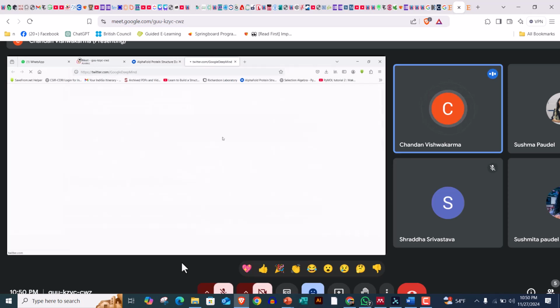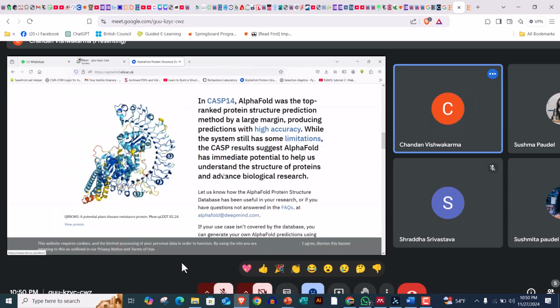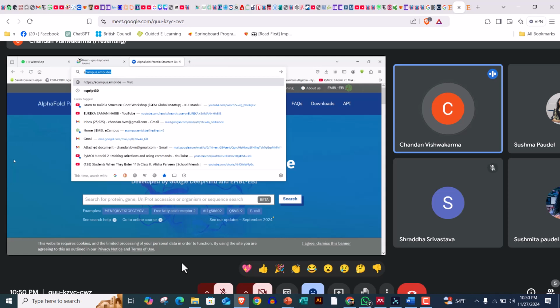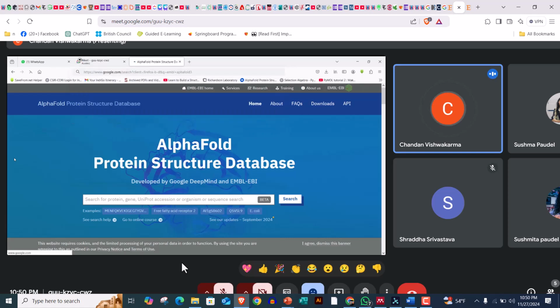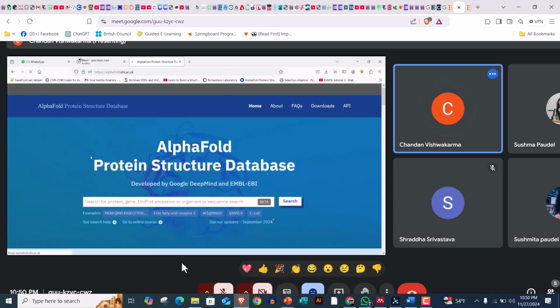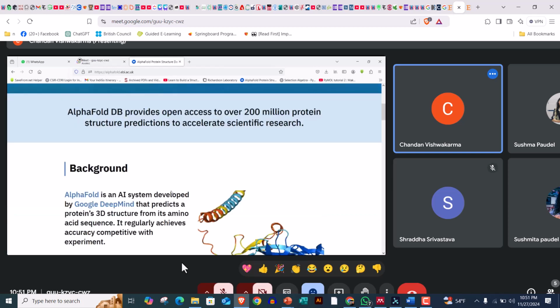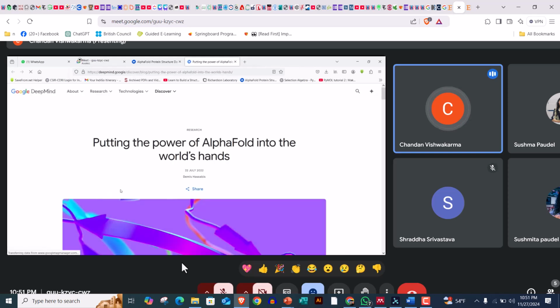I think this is the Twitter link actually. Yeah, this is the main web page. Okay. So here what you can do.